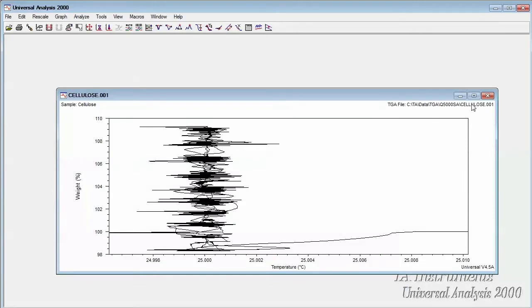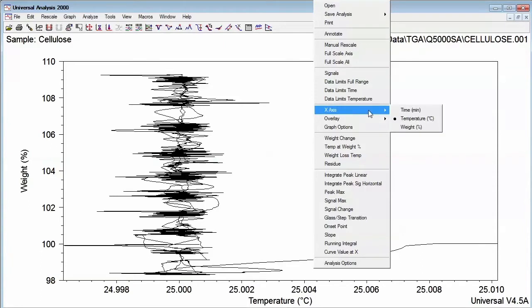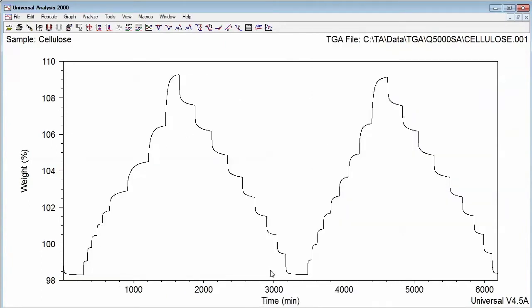Since this experiment was performed isothermally, it's best to set the x-axis to time. To view the sorption-desorption experiment, multiple sorption and desorption steps have been performed for this particular sample.